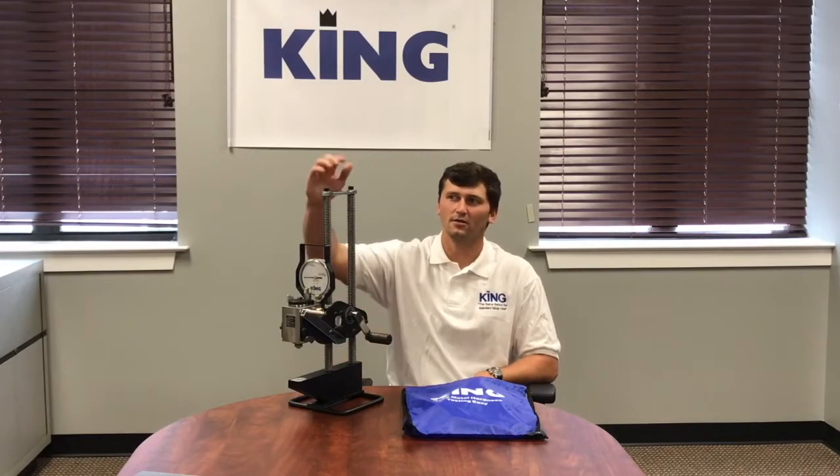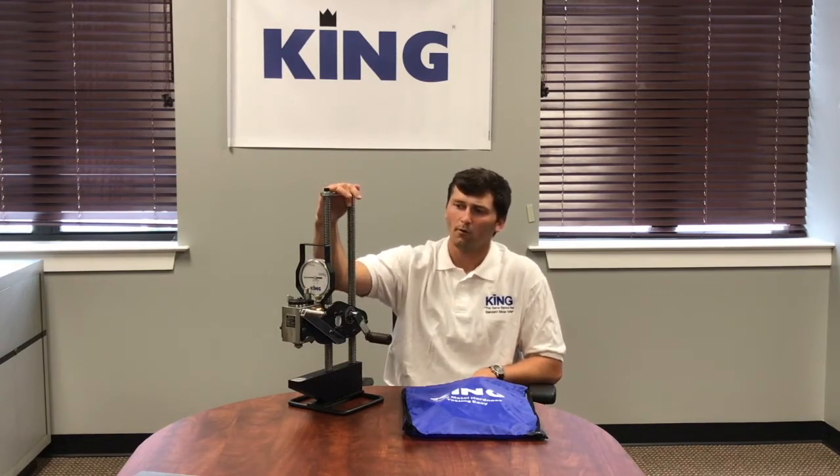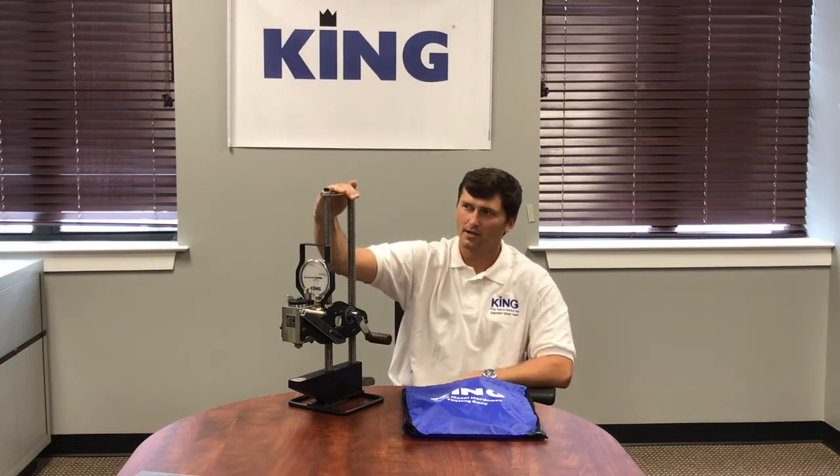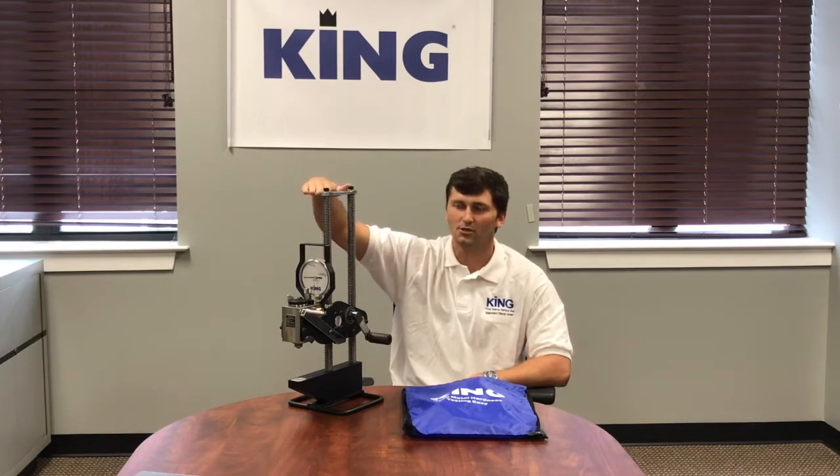Brendan here with King Tester. We are going to go over our A1, our King Portable Brinell Hardness Tester. This is our standard bottle, standard 3,000 kilogram test head with our standard base. You have a 13.5 inch vertical capacity and a 4 inch depth on the throat here.